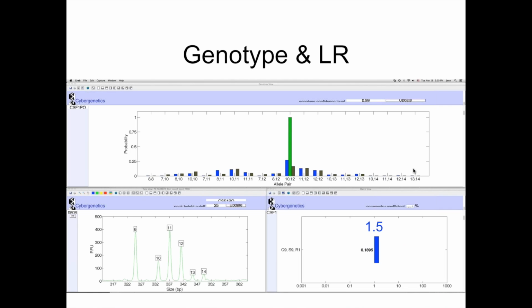Now, looking at the same 3-window view, we see the data on the bottom left, and now the genotype is showing not tremendous concentration on just a few possibilities, but a diffusion across maybe 20 possibilities shown in the blue bars of the inferred genotype.